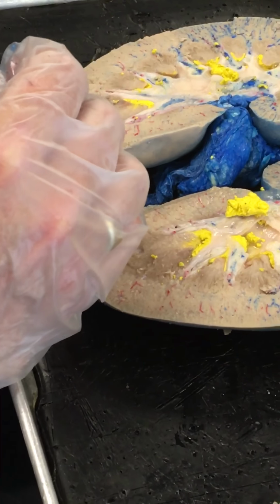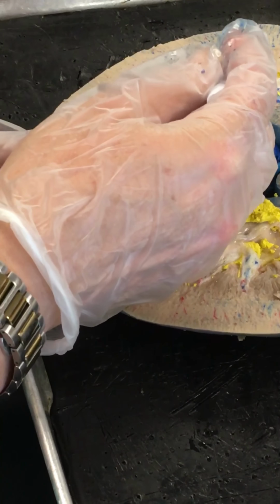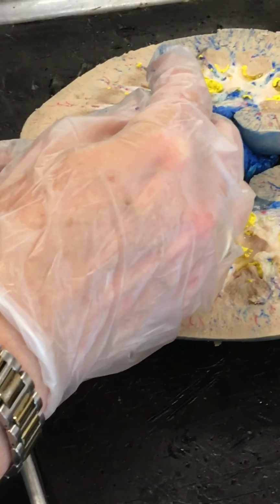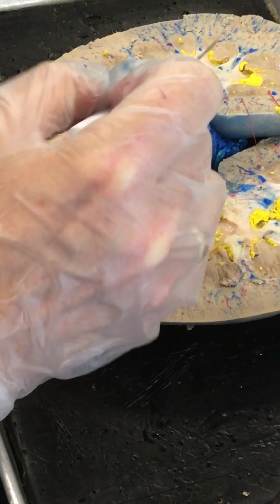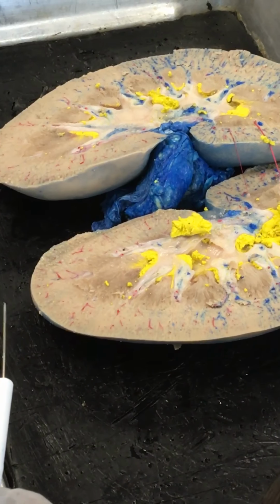The vein side, if we take it back out, our interlobular veins go down to the arcuate to segmental, to interlobar, and then the interlobar go directly into the renal vein. So there's no segmental on the venous side.